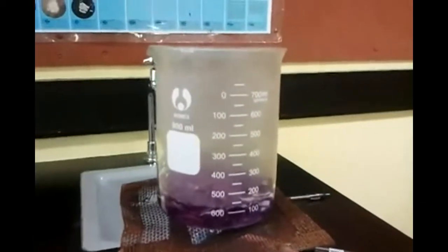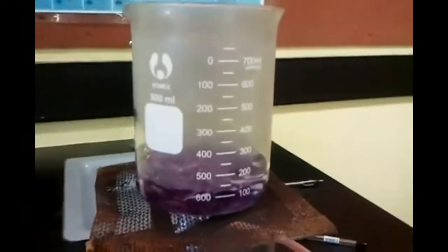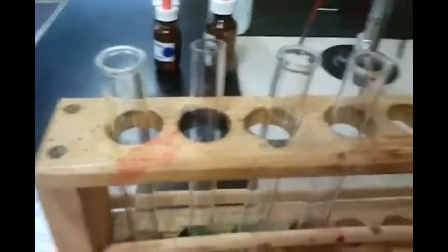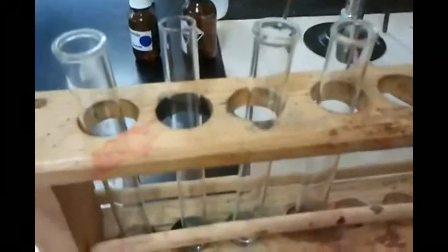This is one part of another prac we're doing. We're boiling the water for a natural indicator — it has red cabbage and 100 ml of water. We're just boiling it to pick up the color. Over here we're setting up our test tubes: one with water, one with sodium chloride, one with hydrochloric acid, and one with sodium hydroxide.